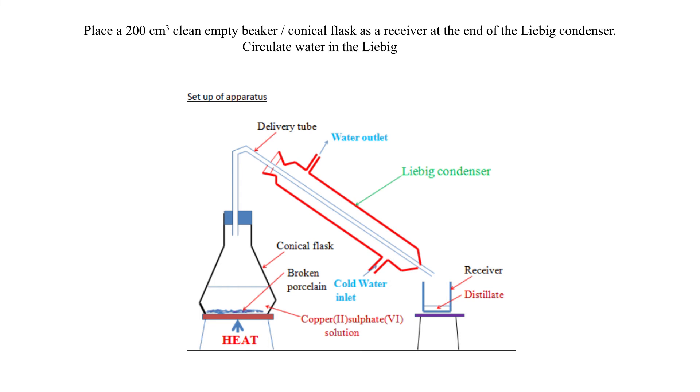Circulate water in the Liebig condenser. Heat the flask strongly on a tripod stand with wire mesh or gauze until there are no more visible boiling bubbles in the flask.